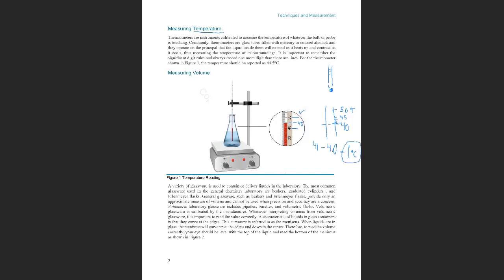1 Celsius. So what you have to do is look at the scale and say, okay, one line and the next one, it jumps by 1. If this is 40, the next line is 41, the following line is 42. It jumps by 1. So when we look at this thermometer, at this red alcohol that is showing the temperature, tell me, what do you see? Your value X is in between which two temperatures?